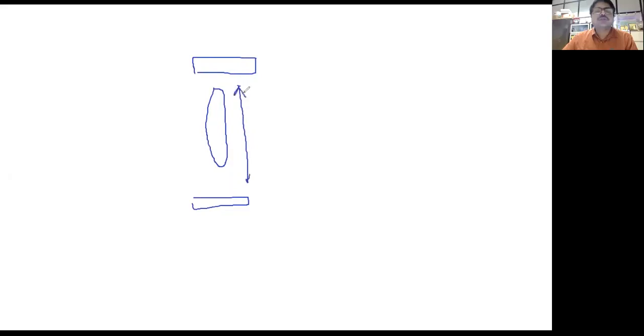So let me draw something for you. Spherical aberration is essentially, if we talk about magnetic lenses, suppose this is your magnetic pole. The magnetic field along this line is not going to be homogeneous. It may be stronger here, right? At the edges, and it will be weaker.